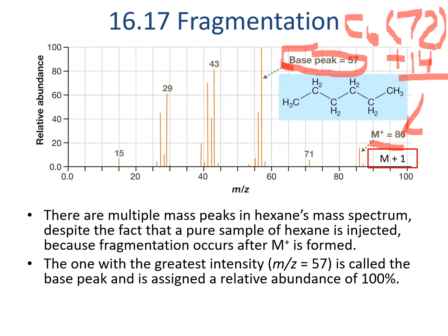On this, we also see a mass plus 1 peak. That's this real tiny peak right here.